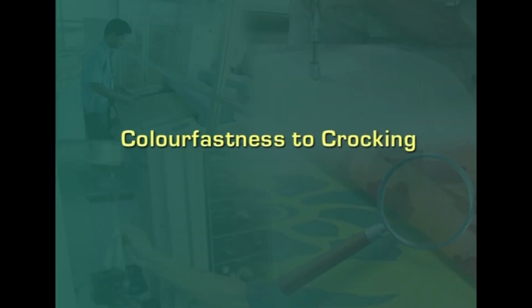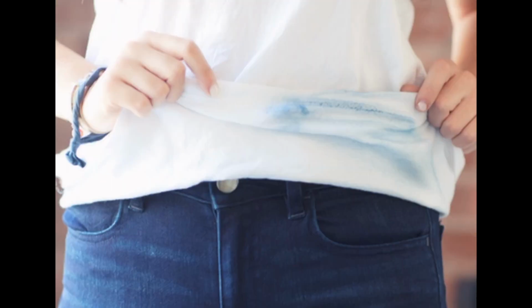And now we are going to see color fastness to crocking. Crocking is nothing but the transfer of color by rubbing to the adjacent material. This generally happens with apparel as well as the upholstery that we use at home as home textiles. Dark shades are more likely to crock than lighter shades because there is a tendency of the loose dye molecules to remain on the surface of the fabrics, and printed fabrics have more tendency to crock than dyed material.